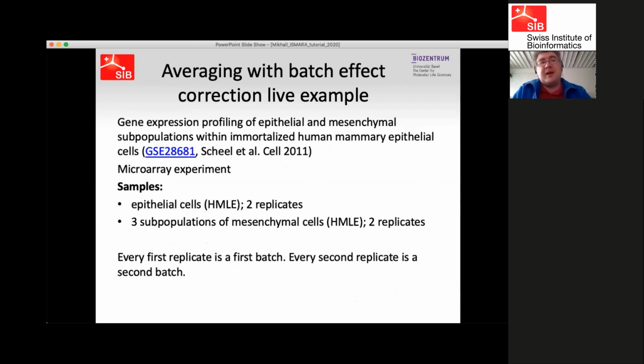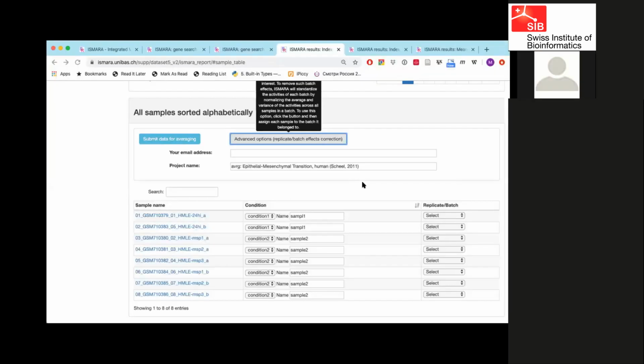If you apply it to everything, especially to systems which do not have a batch effect, you risk getting results which could be wrongly interpreted. Also, batch effect correction has some limitations. It requires that you have the same number of points in every batch.